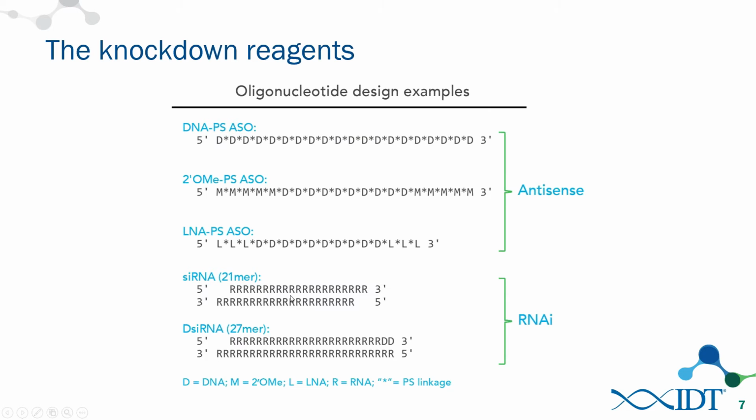And the same is true for the siRNAs. The siRNA 21 mers was compared to a negative control, which was an siRNA 21 mer, and the dicer substrate was compared to a negative control dicer substrate.